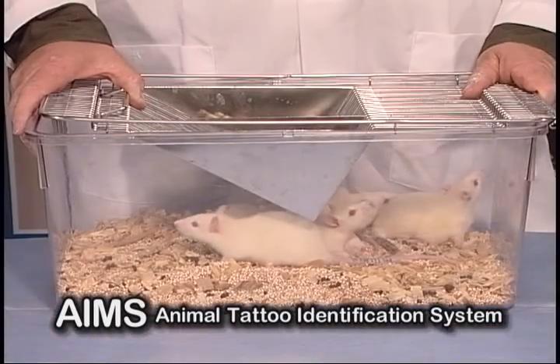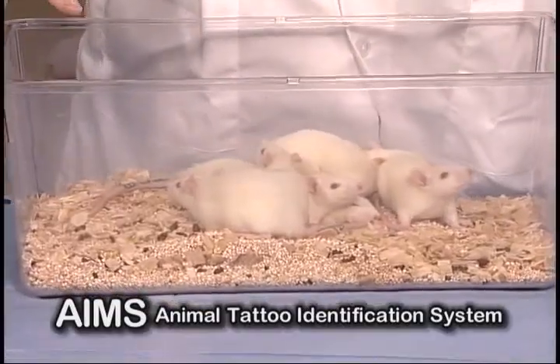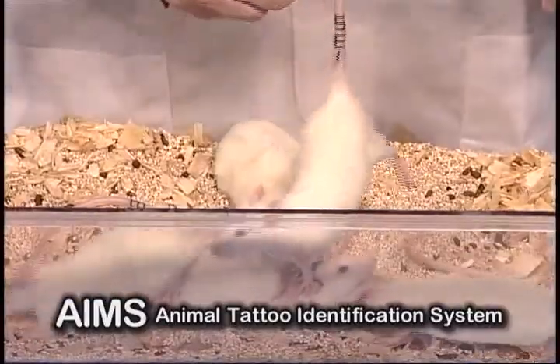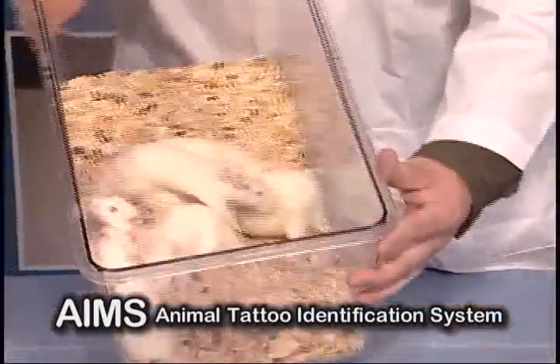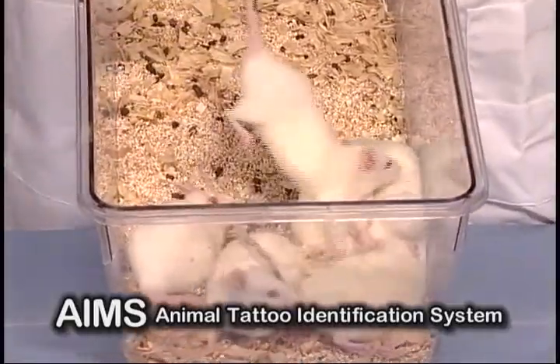Here are the rats that we tattooed during our demonstration today. We didn't tattoo all of them, but you can clearly see which ones have the tattoos and which ones don't. It's a very visible ID method that is very economical and convenient to do.